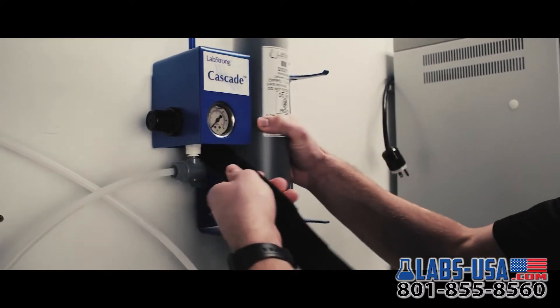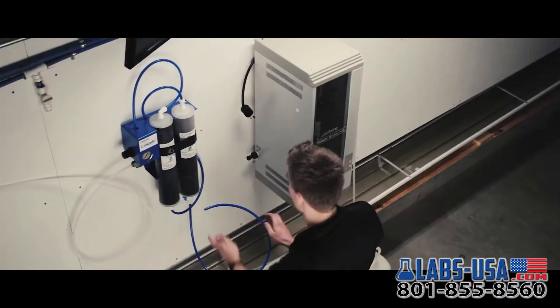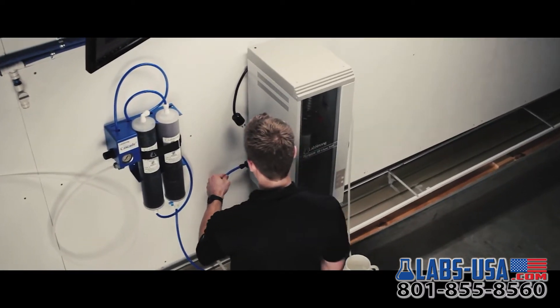The LabStrong Cascade pretreatment system is designed to optimize the still's performance by eliminating scale buildup within the boiling chamber, creating nearly maintenance-free operation.